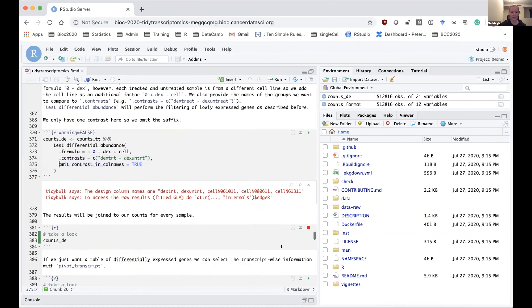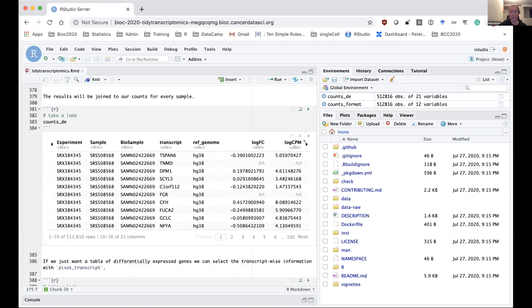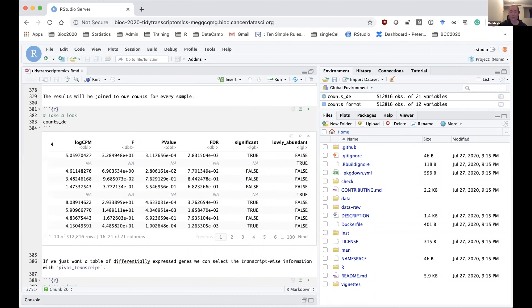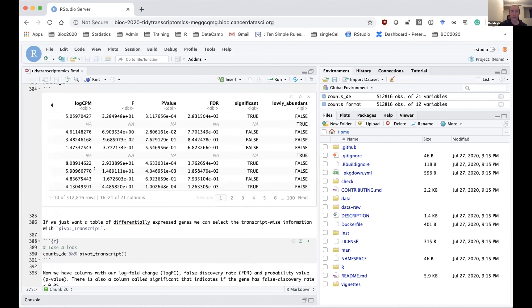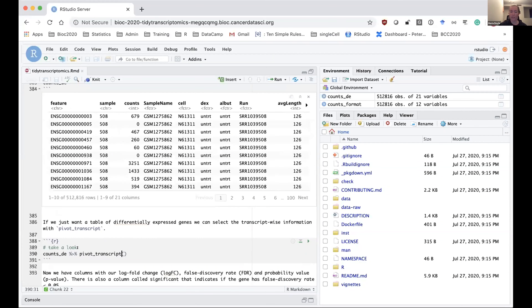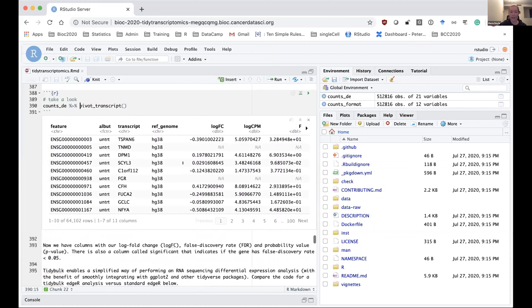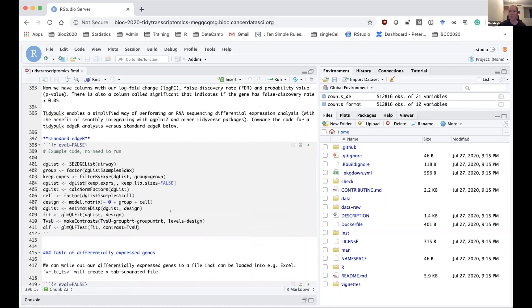Looking at the output, we have our same table we started with, and now we have columns added at the end for the log fold change, p-value, FDR (adjusted p-value), and a column called significant, which indicates whether our gene is below 0.05 FDR. If we just want the table of differentially expressed genes — one row per gene rather than one row per sample — we can use tidybulk's pivot_transcript to get that information.